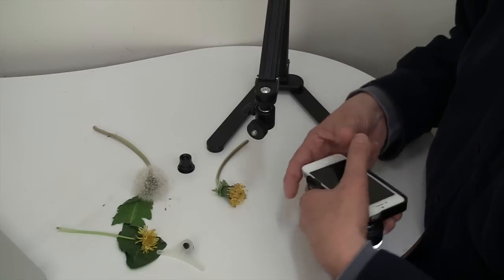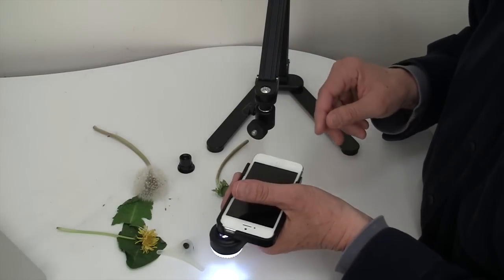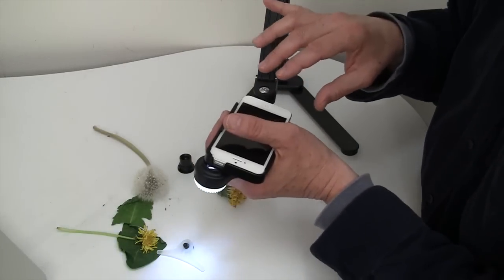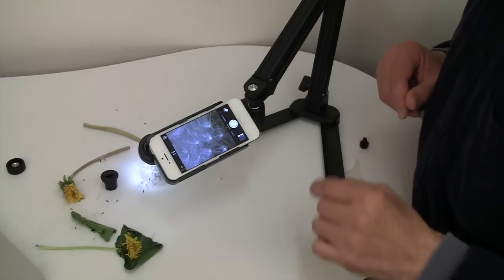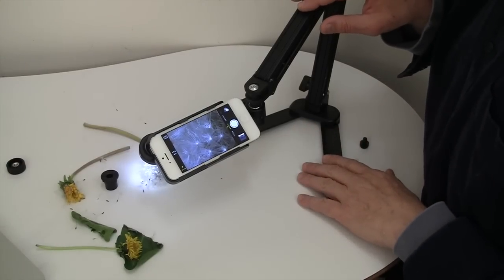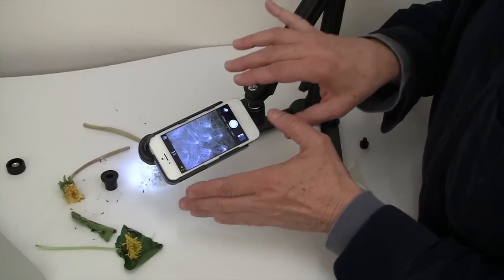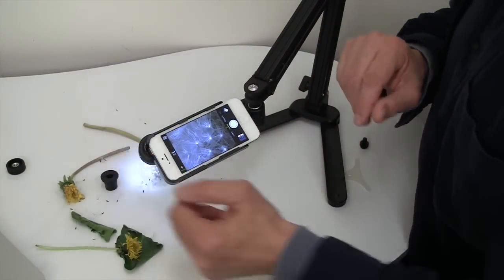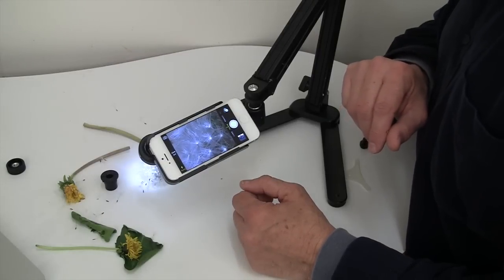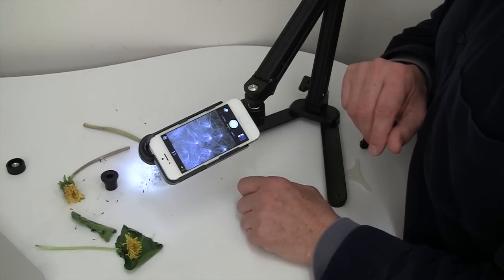Using our ProScope stand, I'm going to attach this, and we'll use this as a flexible viewing station at a distance. So here I am with the ProScope stand, attached to our ProScope Micromobile, using the direct LED lights right onto this dandelion.